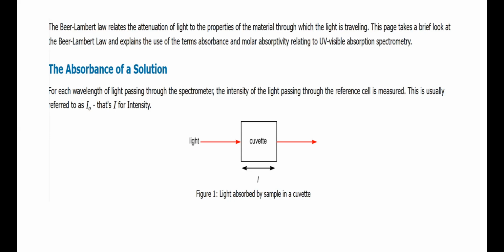The quantity of light absorption is going to depend on how much is the concentration of analyte, but from the light source, what wavelength that sample solution will absorb will depend on the molecular nature of that analyte in the sample. So KMnO4 will absorb a different wavelength, copper sulfate will absorb a different wavelength. So you have to understand the principle, that is Beer-Lambert's law, on the basis of which colorimeter or its advanced version, that is spectrophotometer, works.